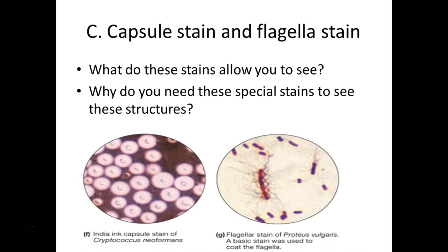So they kind of coat it. And probably the best analogy is mascara, right? We add mascara to the lashes, right? And so you're painting them, so if they're light colored you can see them, but you also will add thickness to them. So it's like sticking mascara on them. When you do that, when you make it thicker, it's easier to actually be able to see it under the microscope. So do you think they're still alive when we do this?